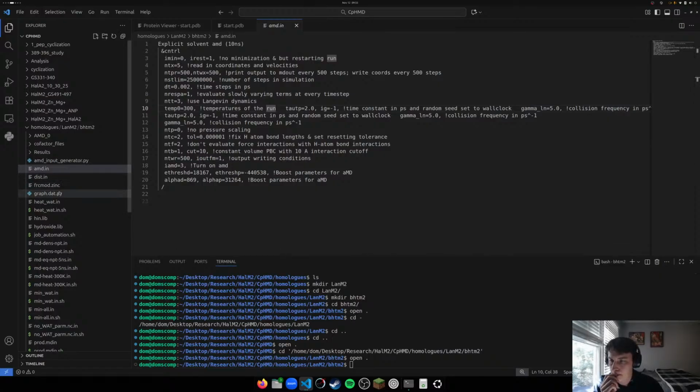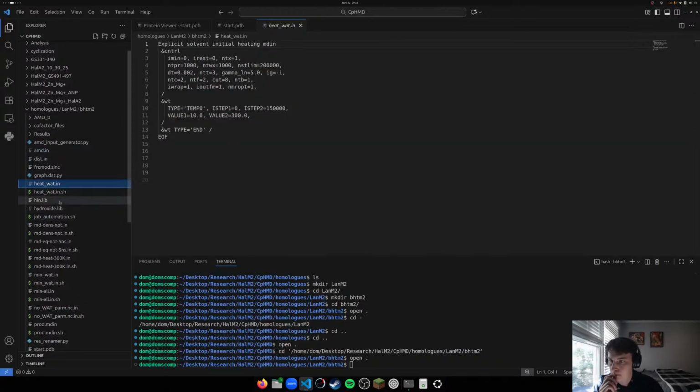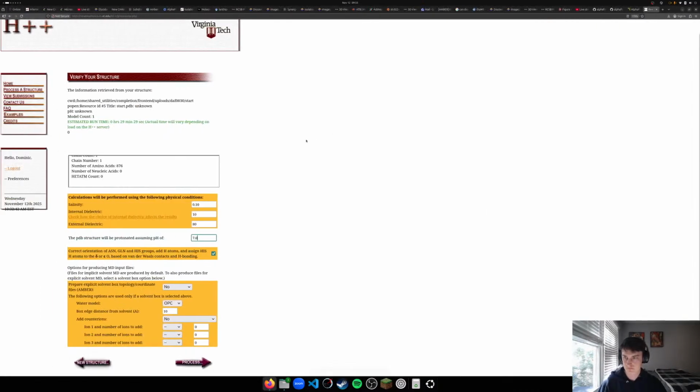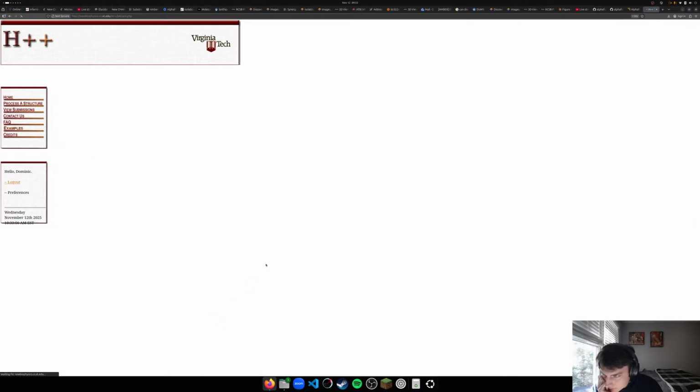I thought we did, somewhere. Okay, 7.5. Yeah. No. Process. Let's see what it does.